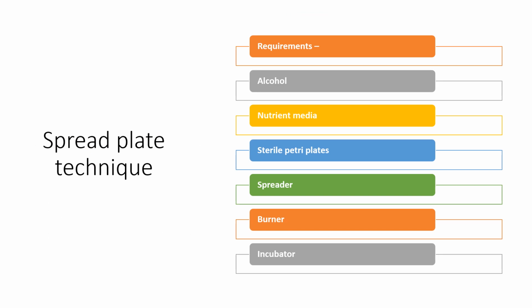Second technique is spread plate technique. Requirements for spread plate technique are alcohol, nutrient media, sterile petri plate, spreader, burner, and incubator.